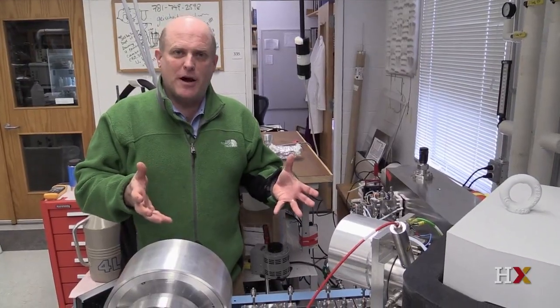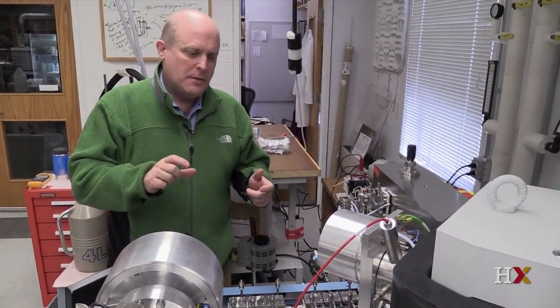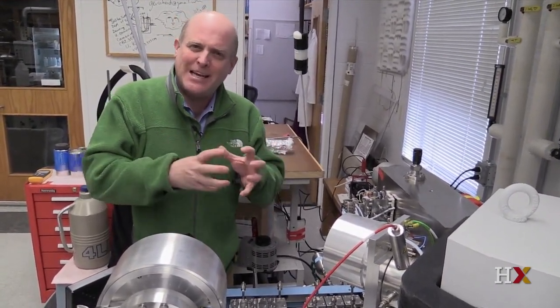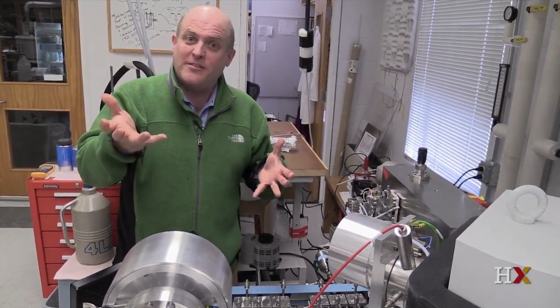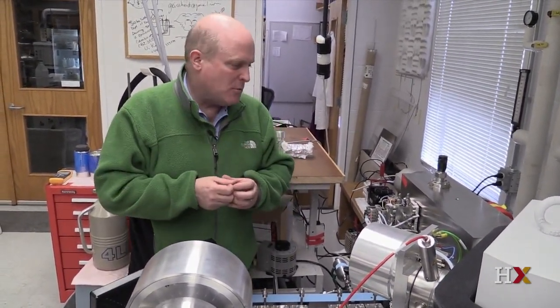Here's another mass spectrometer. It's actually a little bit larger than the other one. We use this for some specialized measurements where we don't just measure mass 44, 45, and 46 for carbon dioxide. We actually measure unusual combinations of isotopes, like mass 47 and mass 48. Mass 47 would be, for example, if you had a carbon-13 and an oxygen-18 on the same CO2 molecule.